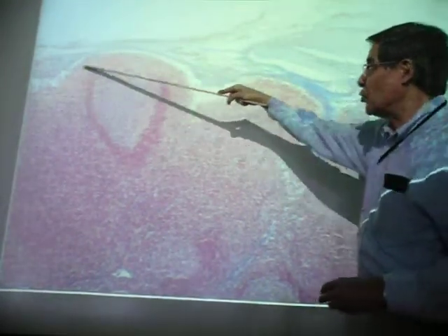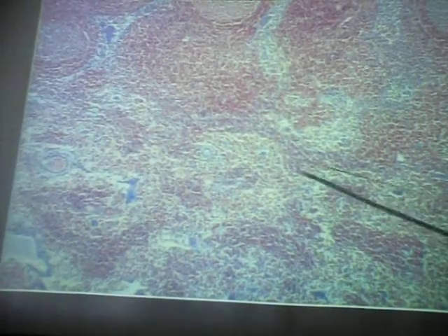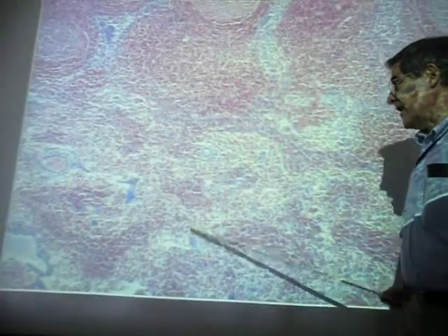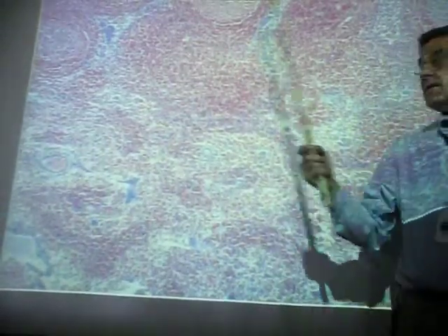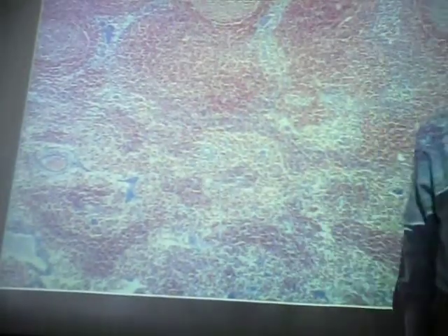The lymph then flows along here in the subcapsular or cortical sinus and then follows the trabeculae in. In other words, along through the trabecular sinuses. Then goes into the interior region here of the organ. What do we know this as? This is the medulla. And these spaces or cavities in here, what are they called? Medullary sinuses.